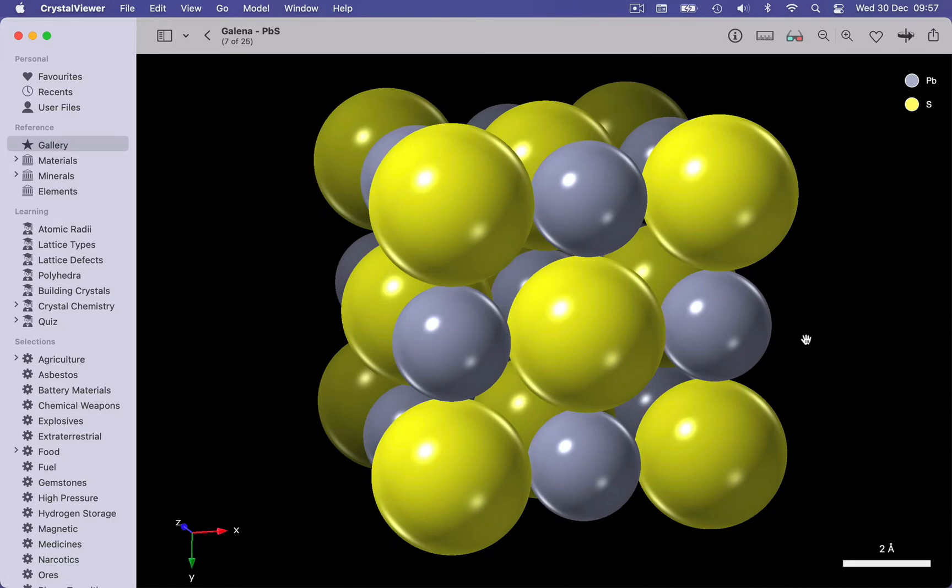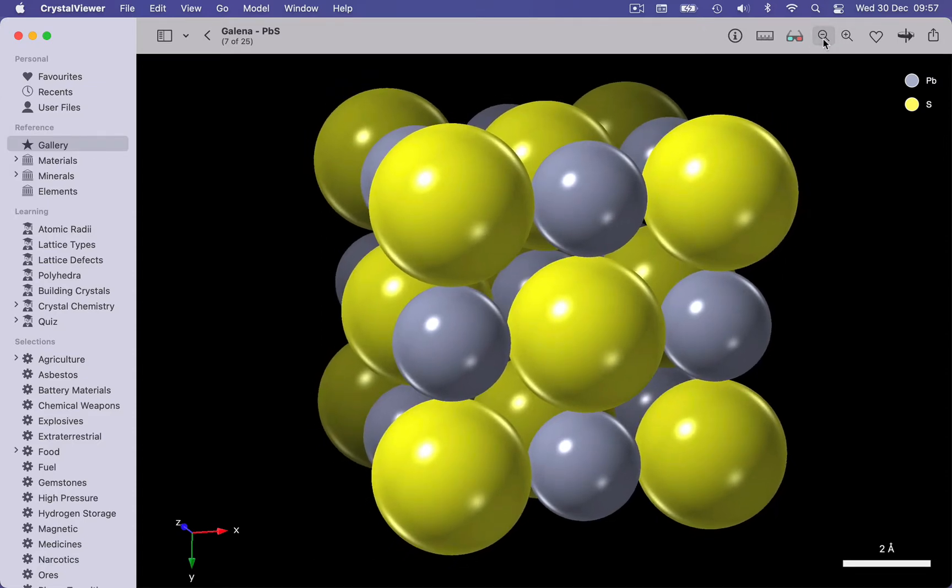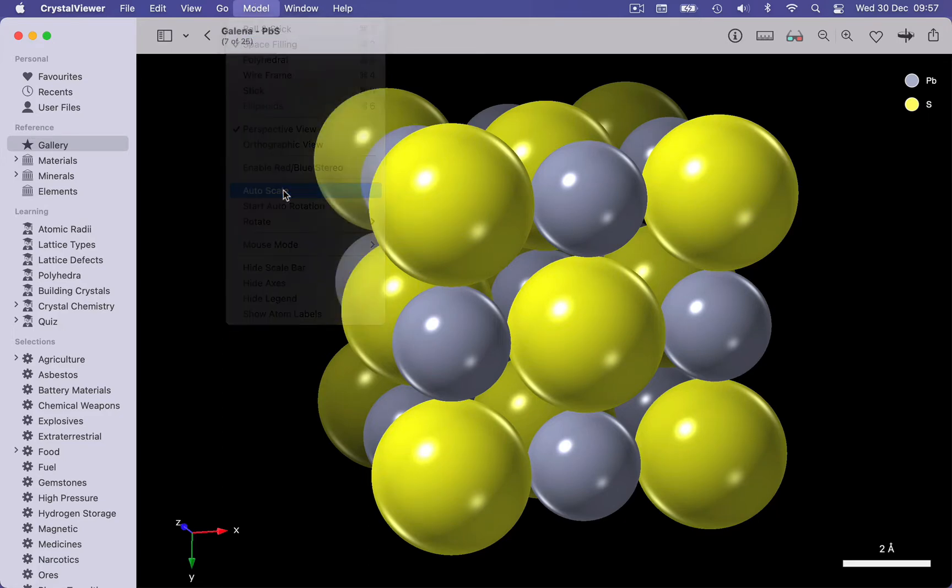You can also change the scale using this pair of scale buttons on the toolbar, expand contract. And you can always reset the scale, we can auto-scale using the model menu. Model, auto-scale.